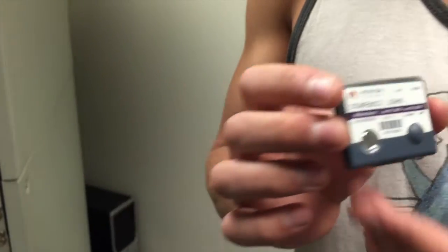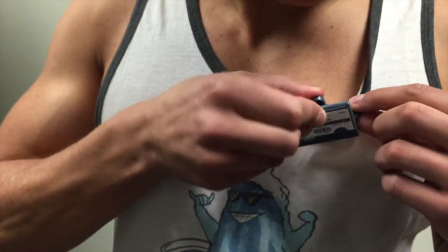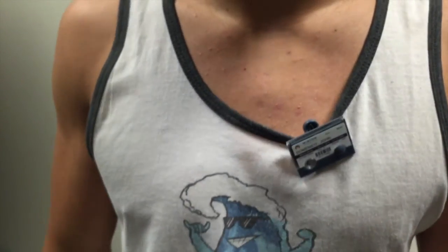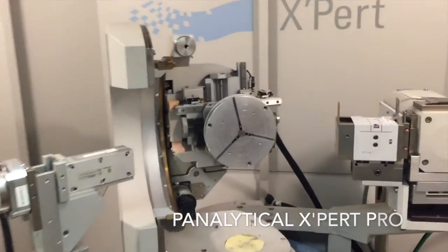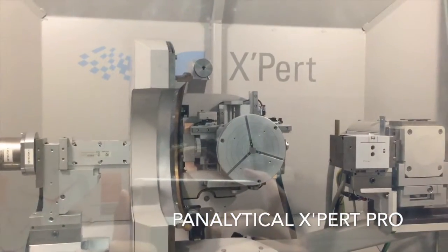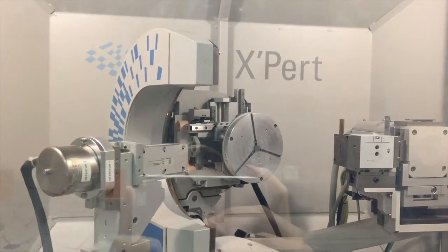While operating an XRD machine, make sure that you are always wearing your film badge dosimeter. This badge will let you know if you have been exposed to an unsafe level of X-rays. The higher resolution machine is a Panalytical Expert Pro X-ray powder diffractometer that can characterize both powder and bulk samples. Here, the high resolution machine is being calibrated and moving to its initial position.